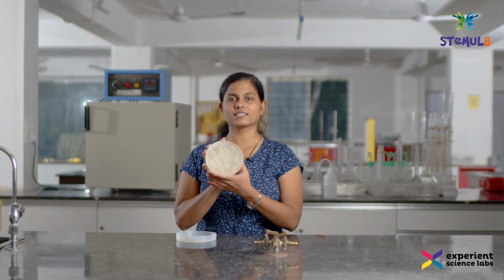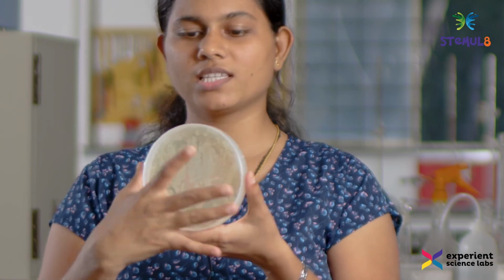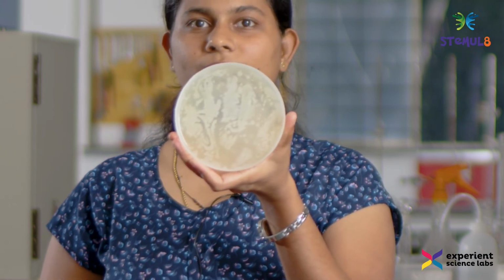So this is a sample. There is the bacterial growth that you can see. These are my fingers which I had kept, the 5 fingers, and you can see the bacterial culture or the colony that is present here.